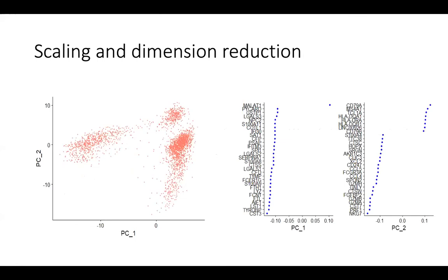in your data? And that is used also for principal component analysis, which is a way of reducing the dimensionality of your data, because you have, let's say, 10,000 cells and each cell has 20,000 genes or 15,000 genes that are expressed. You're essentially looking at a matrix of 15,000 cross 10,000. So how can you reduce that amount of complexity into something that can help you identify the most interesting patterns in your data, right? So that is essentially dimensionality reduction.